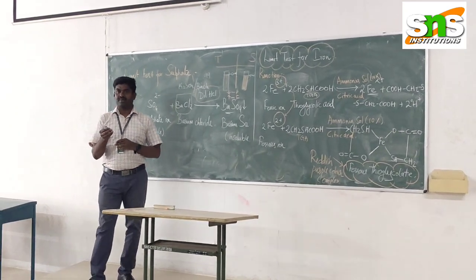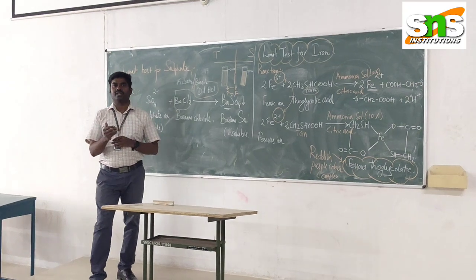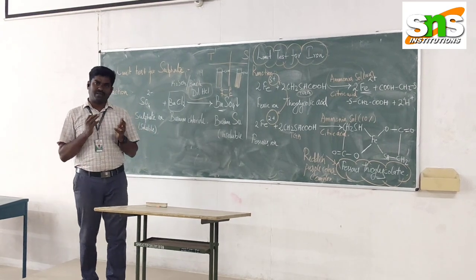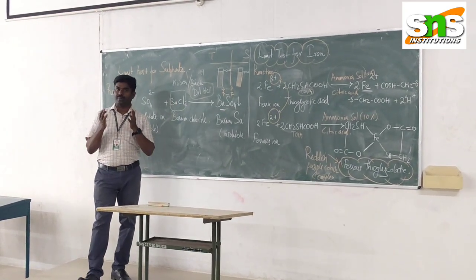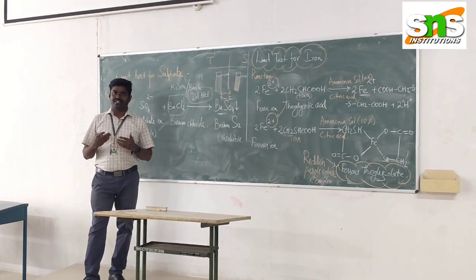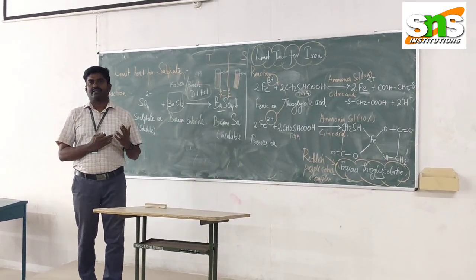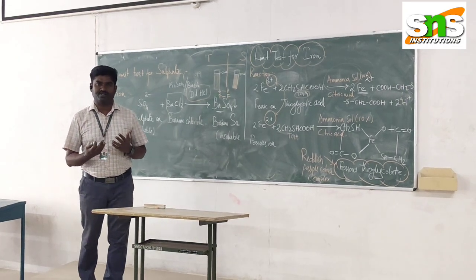This barium sulfate will induce turbidity in your test Nessler cylinder. In this standard Nessler cylinder, we explained it previously. In this limit test, we need to prepare the standard and the test. We take two Nessler cylinders and prepare the standard, or reference. How much quantity of sulfate ions do we need?